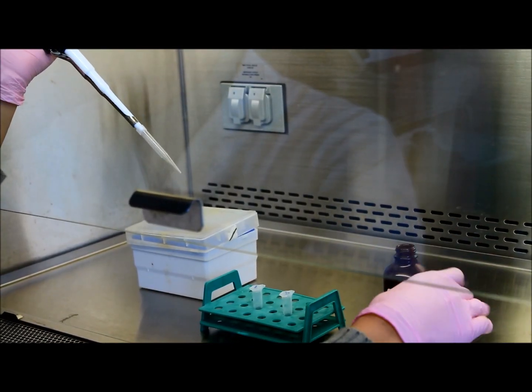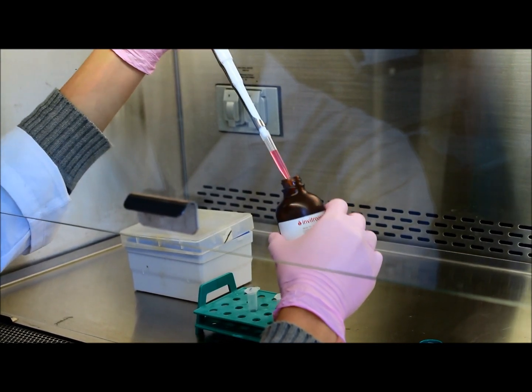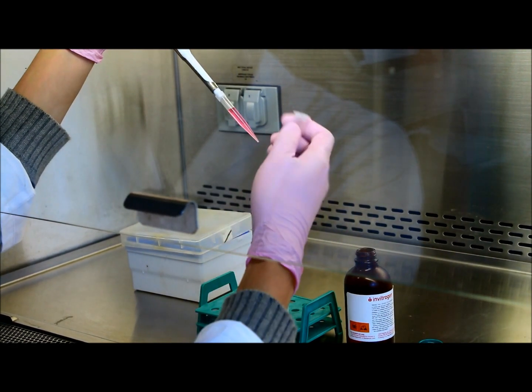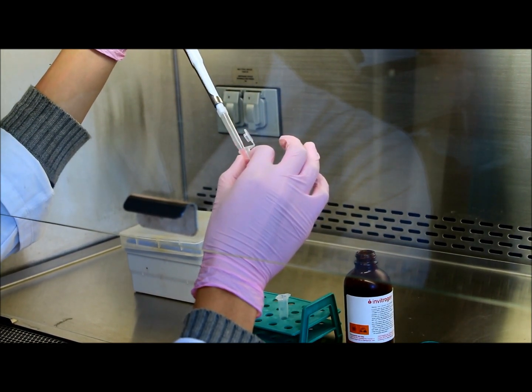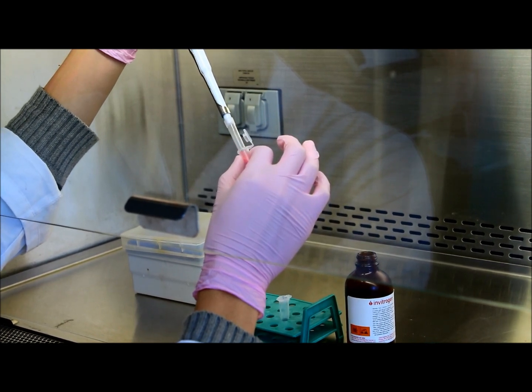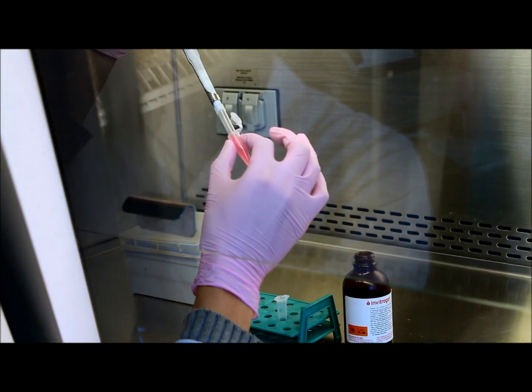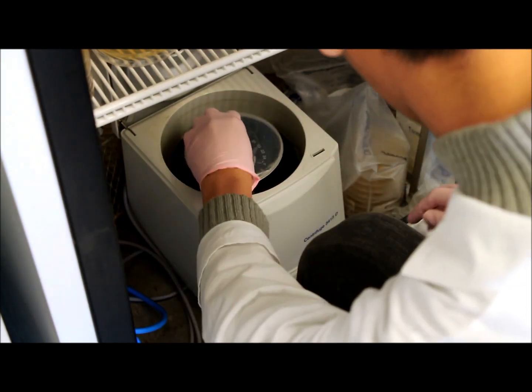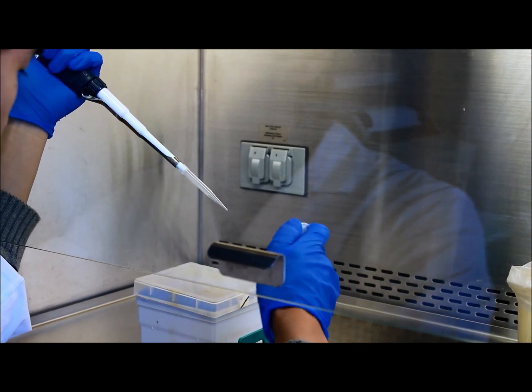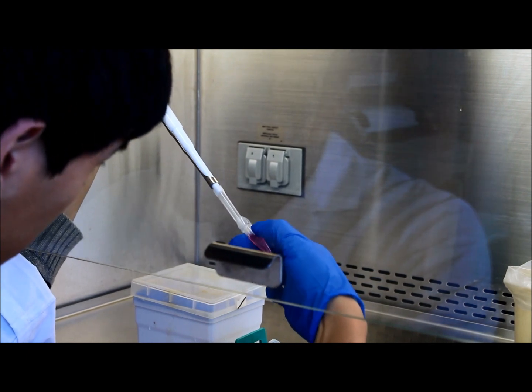The pellet is resuspended in trizol. Lyse cells by vigorously pipetting a few times. Centrifuge sample at 12,000 G for 10 minutes at 4 degrees Celsius. All nucleic acids and proteins in the supernatant are transferred to a new tube.